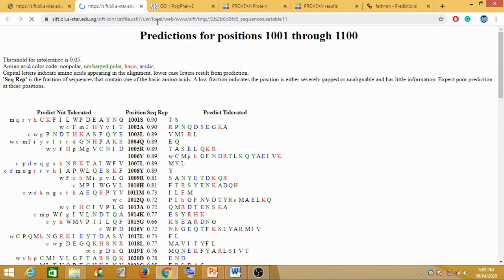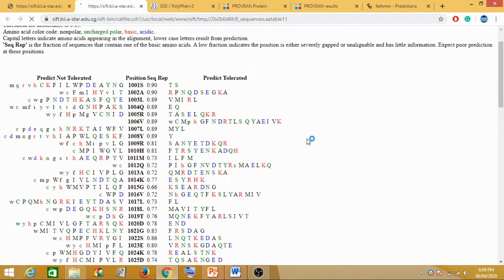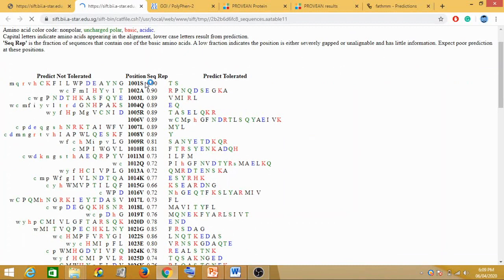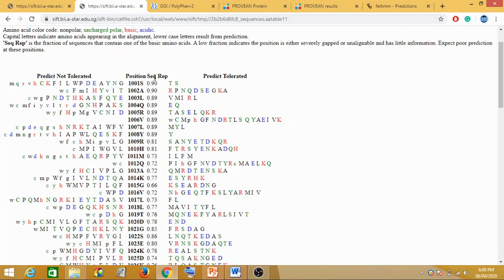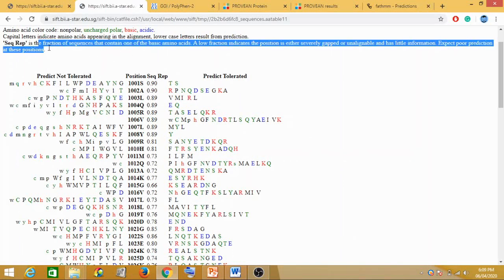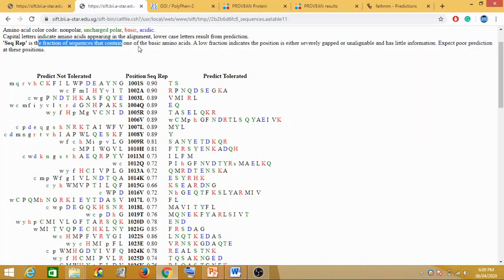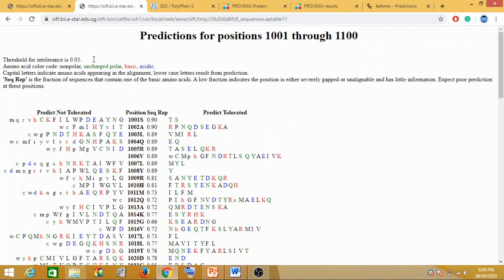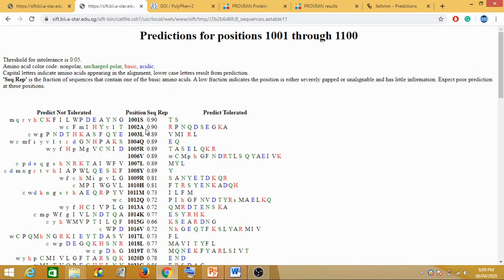Now this is the position, these are your amino acids which are here. Sequence rep you can see is the fraction of the sequence that contains one of the basic amino acids. It's not a score, it's just a sequence fraction, not a score or anything of that sort.